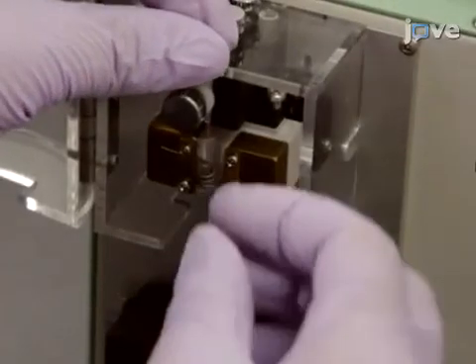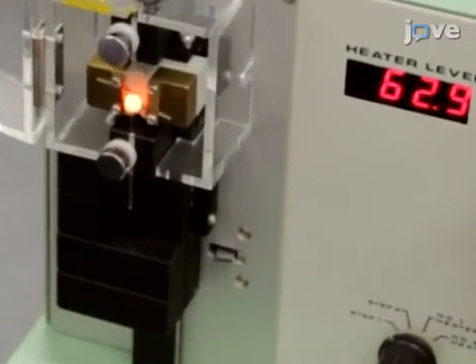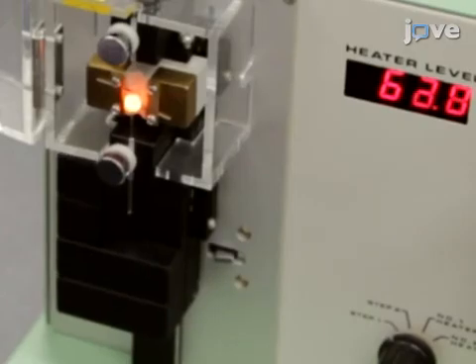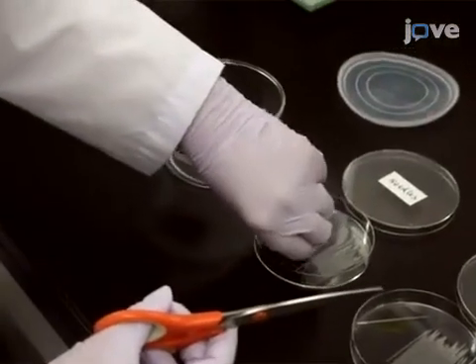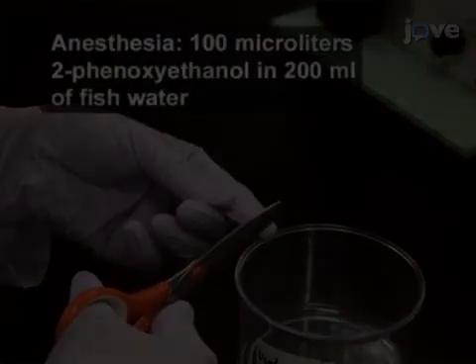To prepare the glass micro capillary needles for blood collection, begin by pulling a one millimeter outer diameter glass capillary with a needle puller. Then, using fine scissors, cut the needle tips obliquely.